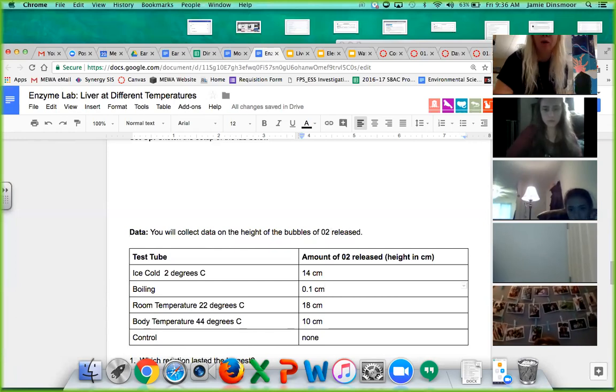How boiling was boiling? Oh, great question. That's done boiling now, but it was full on boiling, so we're going to say it was at 100 degrees.